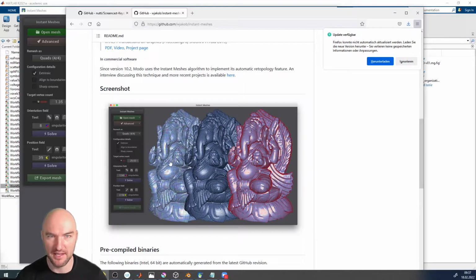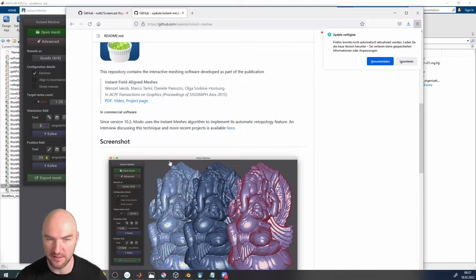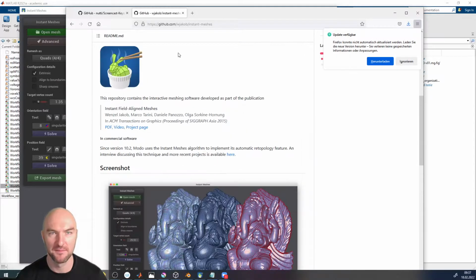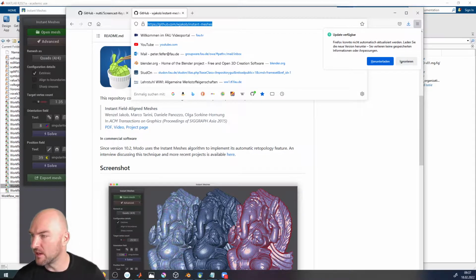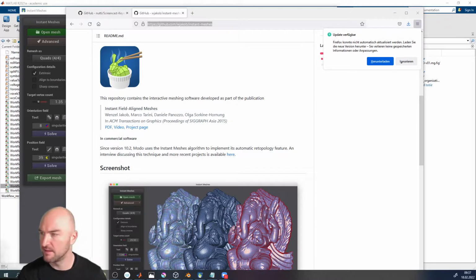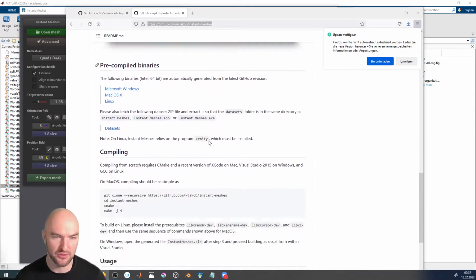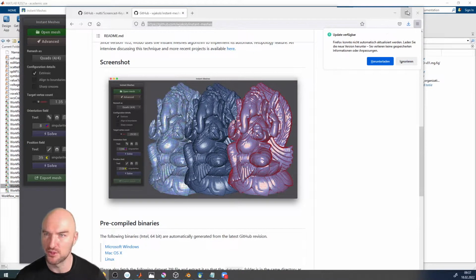What Instant Meshes does is essentially it calculates the principal curvatures of your mesh. Okay, it didn't include the link, but I can just put it in. It's a quick download that you should be able to do in a couple of seconds. It produces weighted distance fields, curvature fields on the surface, and estimates of what a good remesh would look like. In this case, with quadrilaterals or triangles, you can pick that, and it will just know how to do that.